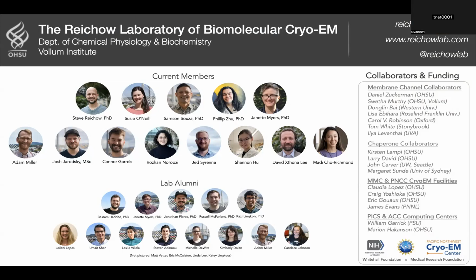So, hello. Hello. Hi. Thanks for the super interesting talk. I had a question about your protein when you put it on grids and whether you had troubles at all with preferential orientation.